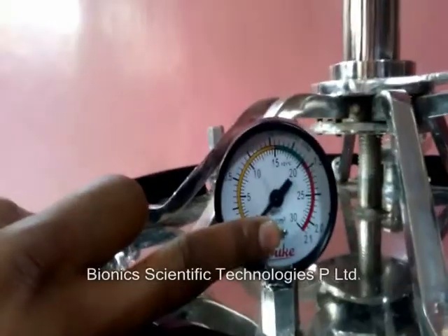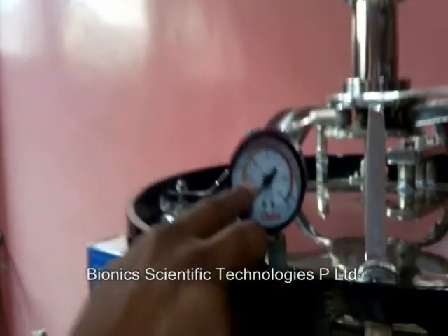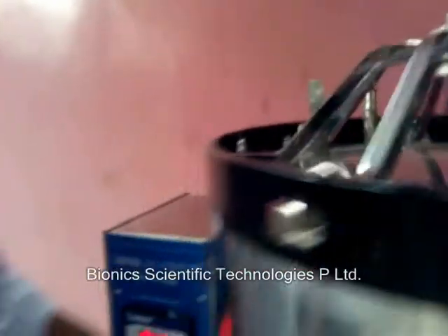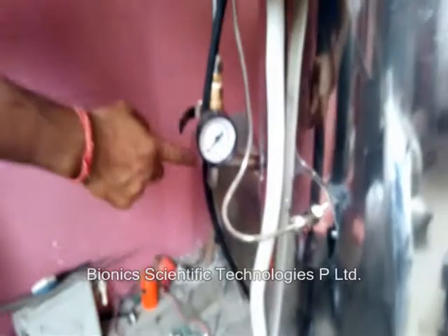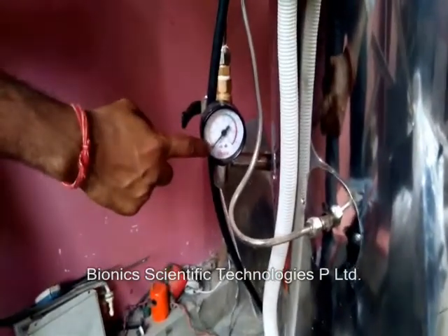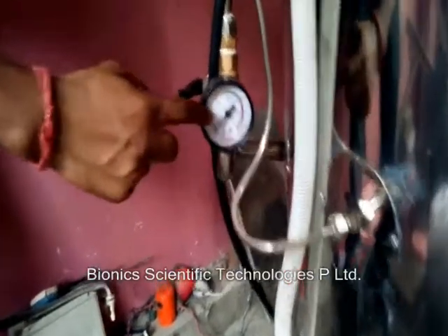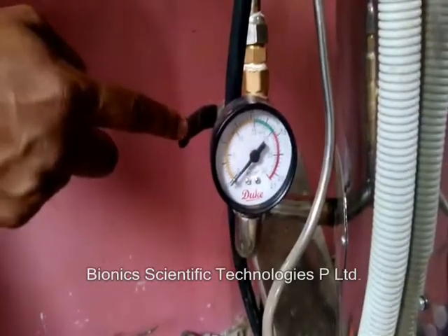This is all from our side. The chamber vacuum pressure gauge will show the pressure inside the chamber — it is showing zero now. This is basically a triple-wall vertical autoclave. The jacket pressure gauge will show the pressure of the jacket. When it comes to 15 PSI we have to shift this into the chamber.